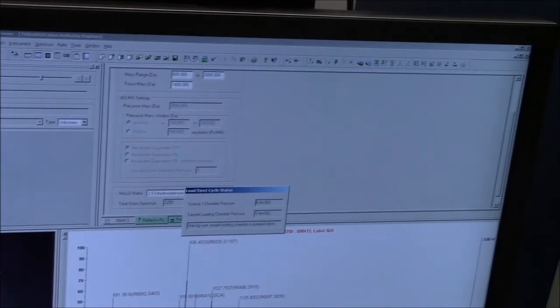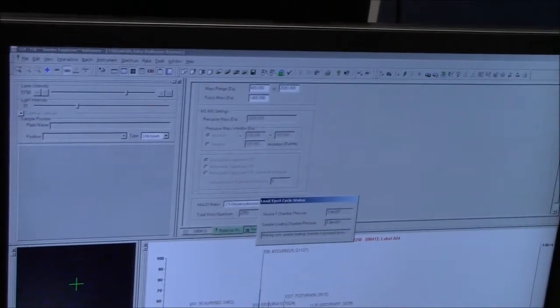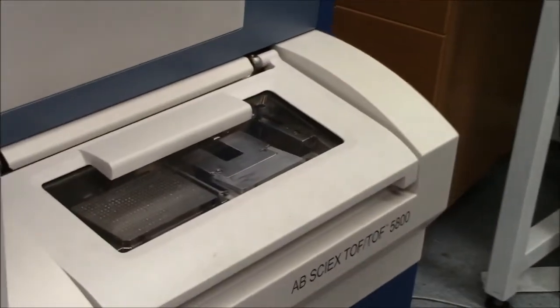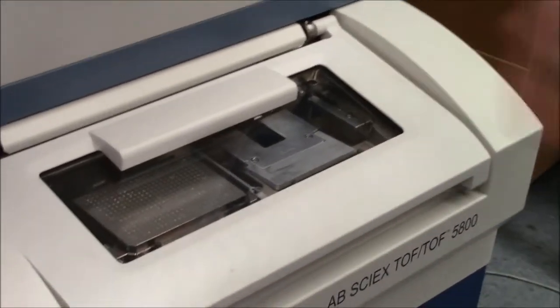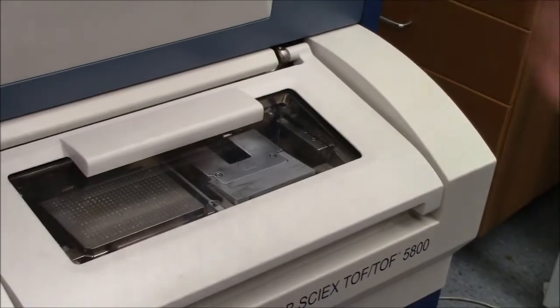And so then it will, this is why it's nice to dry the plate, because then it doesn't have to sit in the anti-chamber so long. So it's not going to let it come out of this lock until it's in pressure. So it's going to pull it into this first lock. So it's pulling a vacuum now? Pulling a vacuum on the lock. Then it will open the transfer door and you'll see the robot arms come in and pull it into the stage.